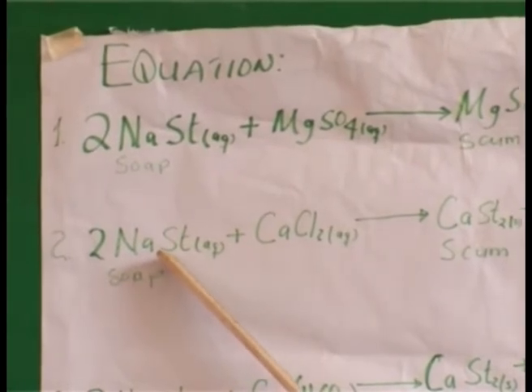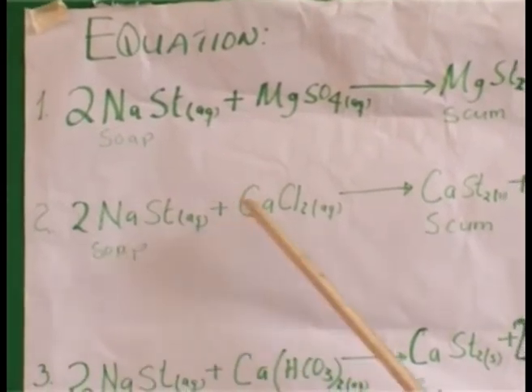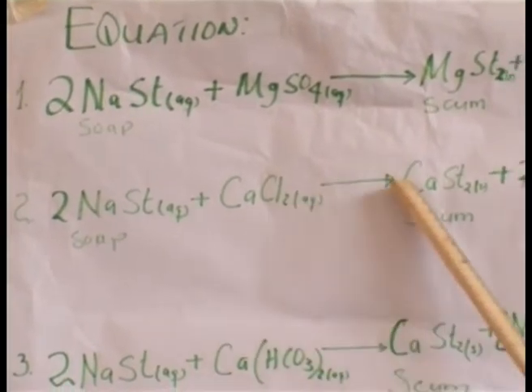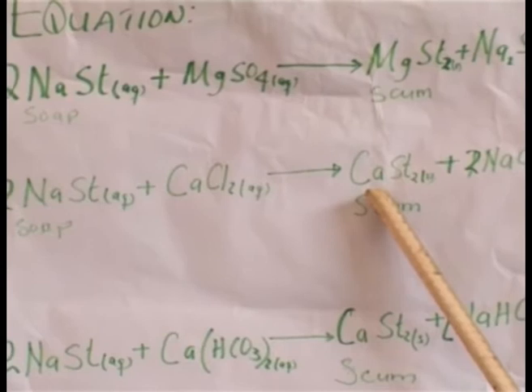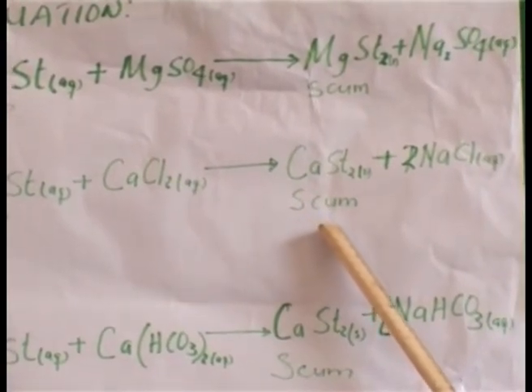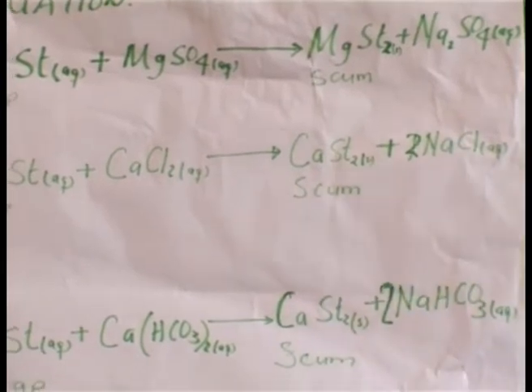Or sodium stearate, which is soap solution, combined with calcium chloride solution to form calcium stearate, which is scum, as we have seen in those test tubes.